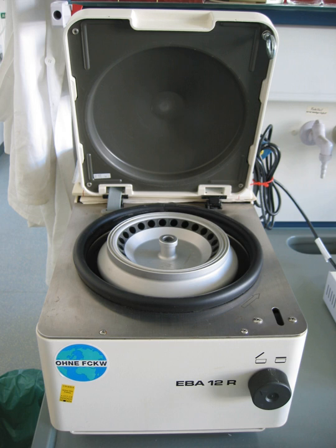Topic: Types. There are various types of centrifugation.